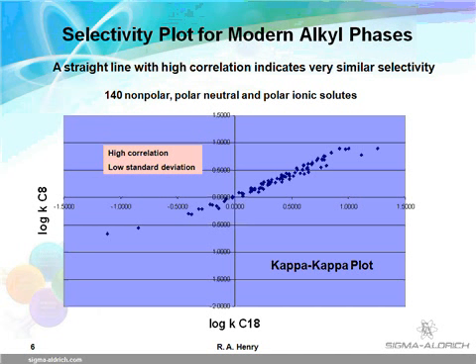Modern C18s have become very similar in selectivity, even for basic compounds, because silica quality and bonding techniques have improved to the point that silanol effects are minimal. The main reasons for looking at two C18 columns would be for improving peak shapes and gaining slight changes in selectivity.